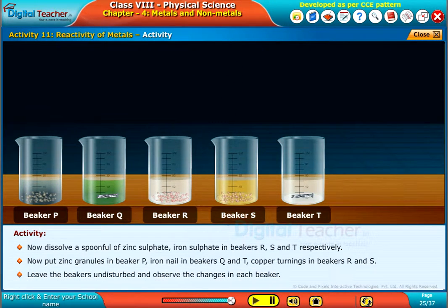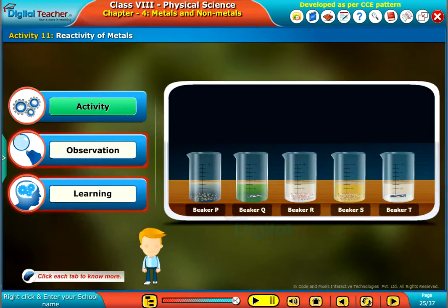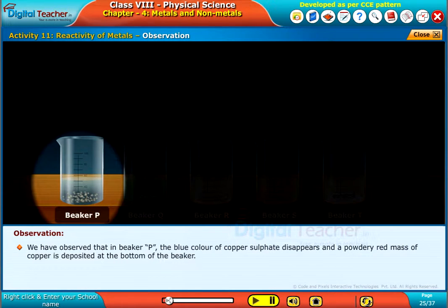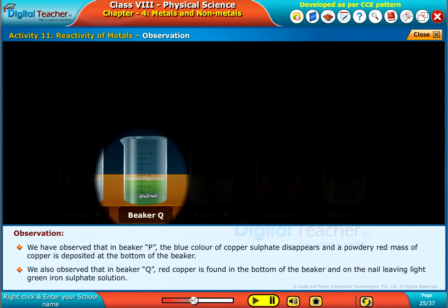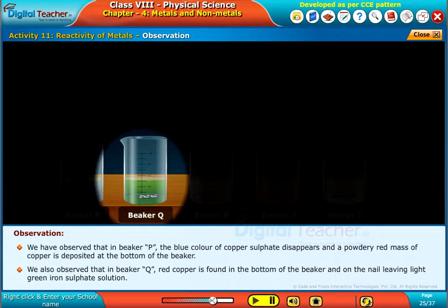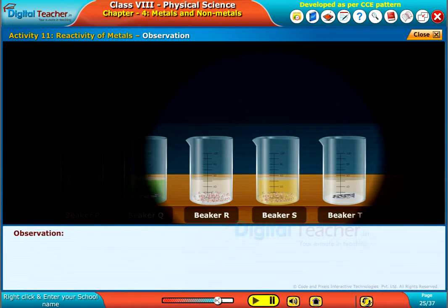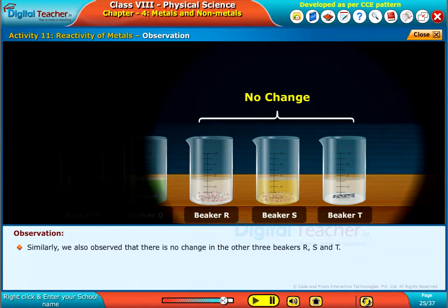Leave the beakers undisturbed and observe the changes in each beaker. We observed that in beaker P, the blue colour of copper sulphate disappears and a powdery red mass of copper is deposited at the bottom. In beaker Q, red copper is found at the bottom and on the nail, leaving a light green iron sulphate solution. There is no change in the other three beakers R, S and T.